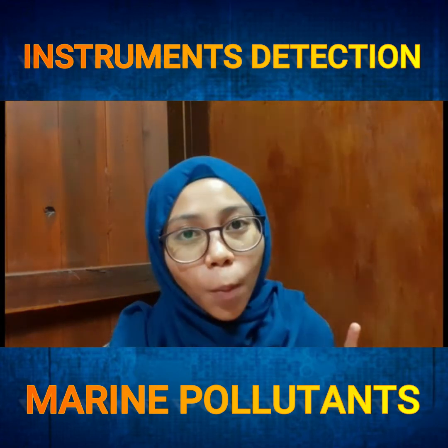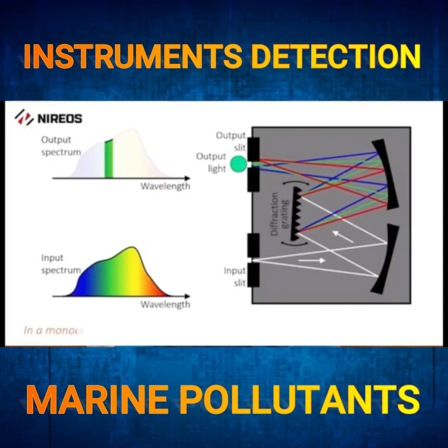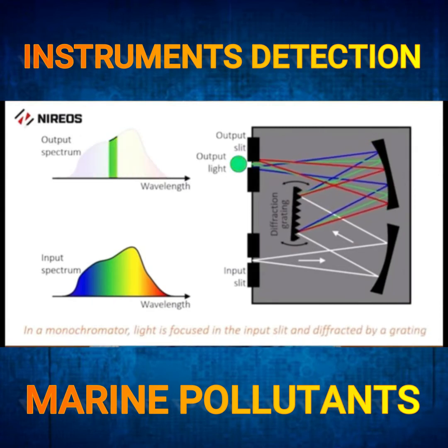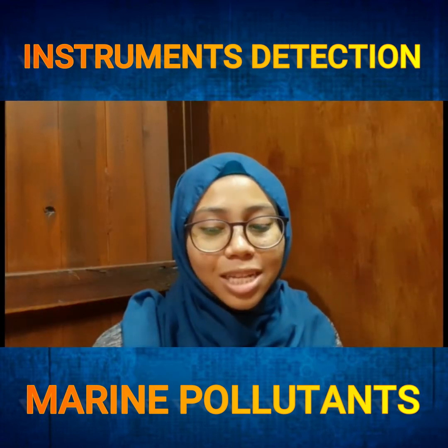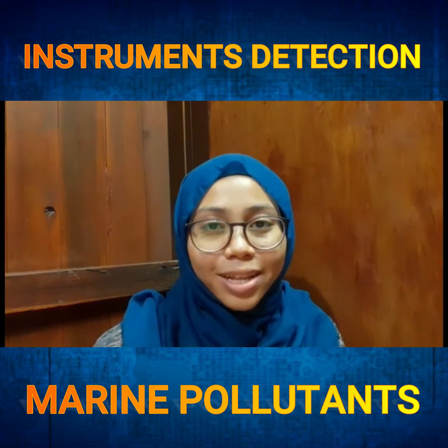The third basic component of the GFAAS is a monochromator. A monochromator is for selecting only one of the characteristic wavelengths, either visible or ultraviolet, of the element of interest. And the fourth one, a detector, which is a photomultiplier tube that measures the amount of absorption. And lastly, a signal processing computer system, such as a digital display or printer.